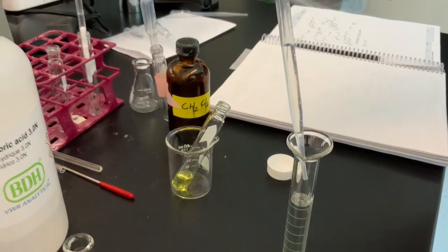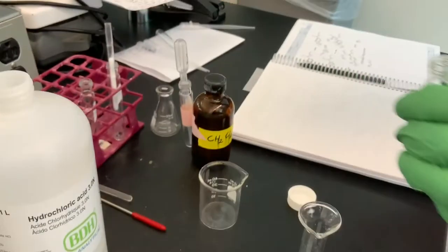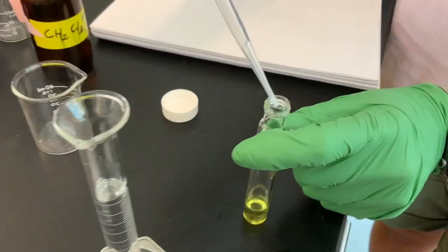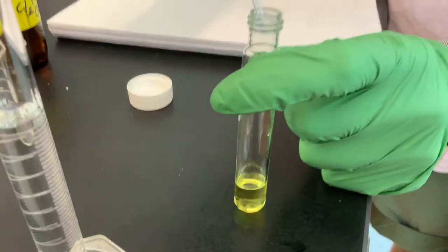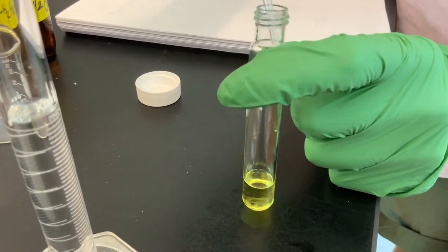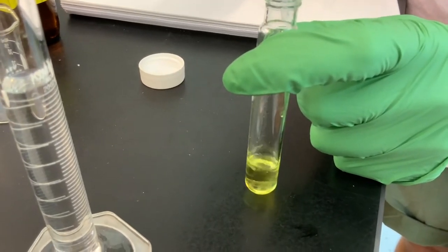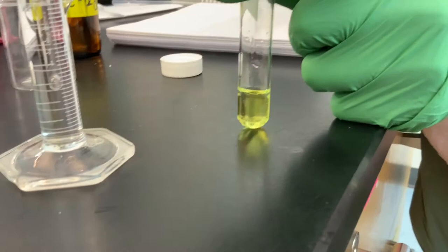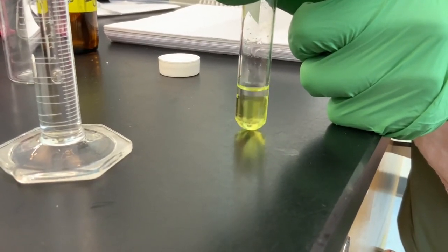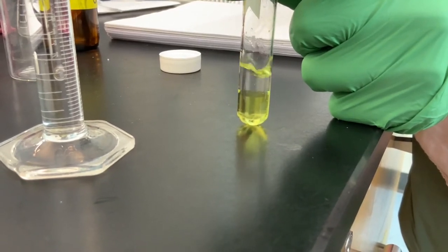So this is approximately 2 milliliters. And of course, we're going to see as we add the aqueous hydrochloric acid, just here's one drop for you, that it's going to sit on top of the organic layer, right? So just like the partition coefficient experiment, we now see two phases, two layers.